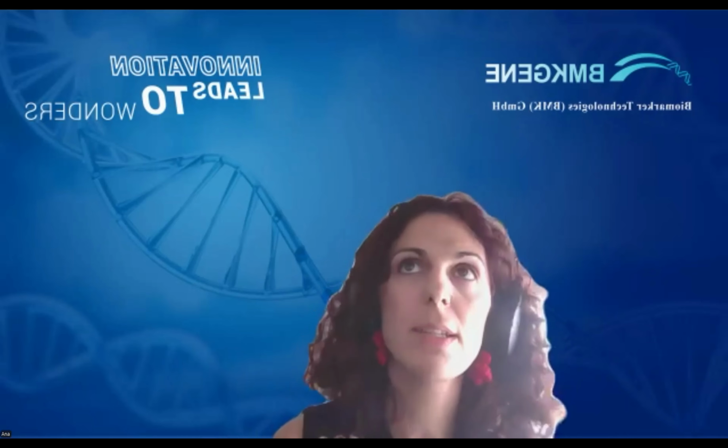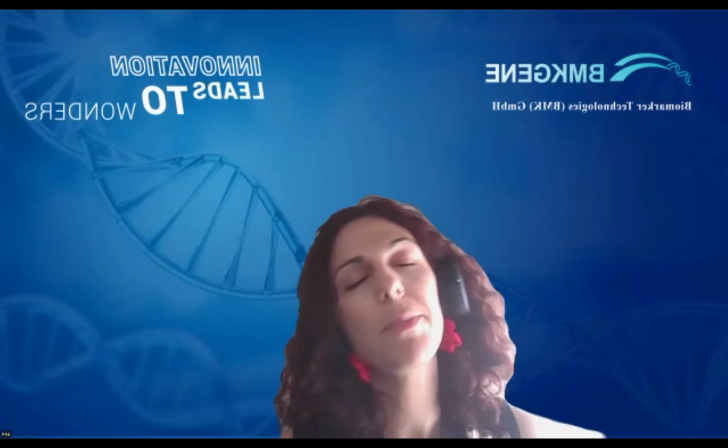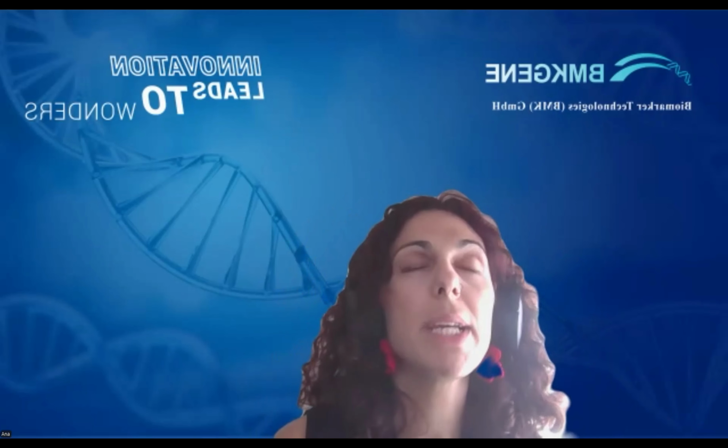In our standard bioinformatic package, we provide beta diversity analysis using 4 indexes, but in BMKCloud you can also do some more customized analysis and regenerate the graphs, etc. The indexes that we use are Bray-Curtis, Jaccard, and then UniFrac. The main distinction here is that it can be weighted or unweighted.